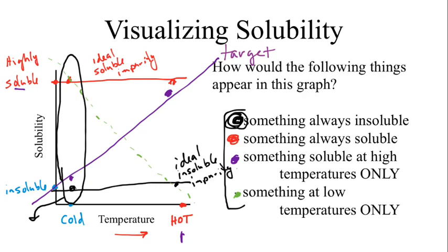You might have guessed one option. We could filter, to get the solid away from a liquid. But I'm going to say that's not quite accurate enough. I want to add a little bit more detail to that. We need to do a cold filtration, because if it was hot, it wouldn't work. So we need that extra piece of information as far as our procedure goes.